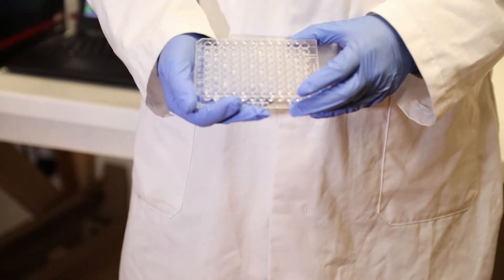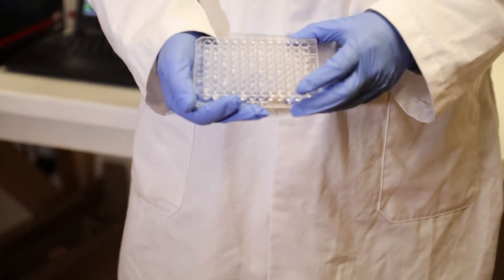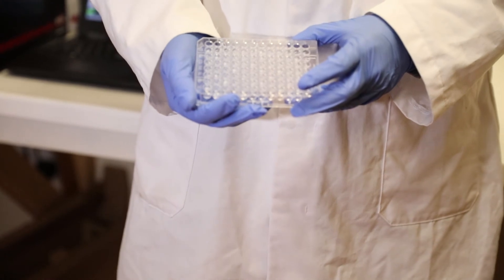The second is a classic 96-well plate where we've put some magnetic stirring fleas and we're just going to do a close-up where we can see them all moving together.